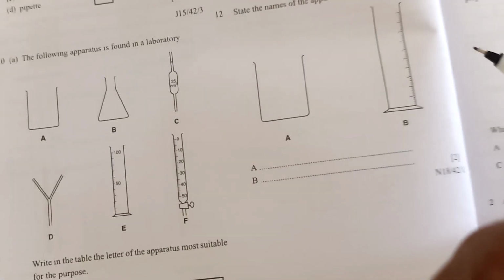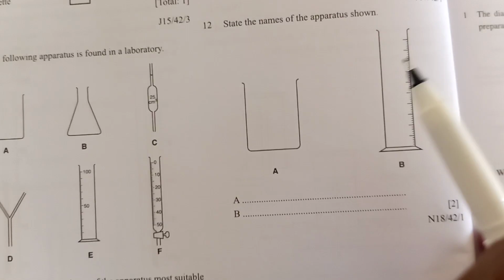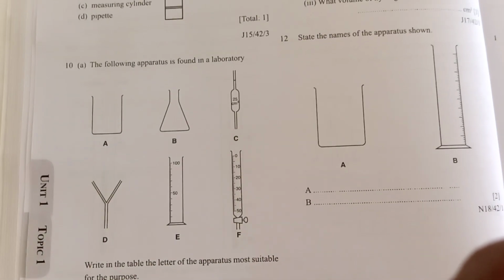Okay, now final question. State the name of the apparatus. This is a beaker and this is a measuring cylinder. Okay, it's quite easy, the questions. Okay, right. Okay, bye bye.